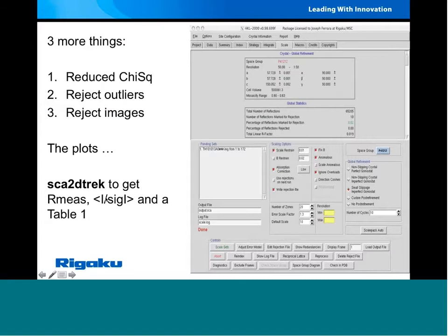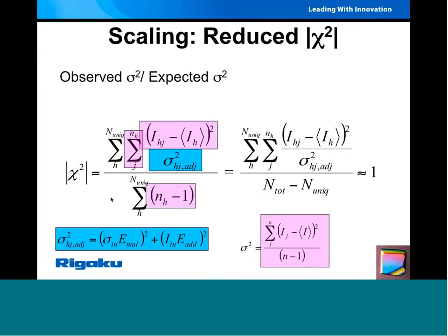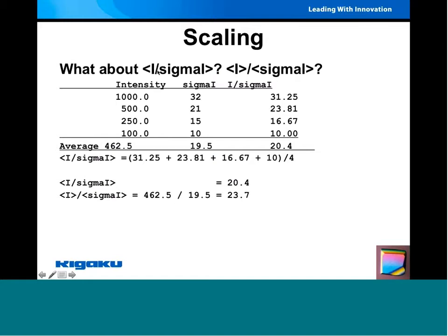PowerPoint presentation. One of the things that I wanted to also point out, this is how we get R measured. So if reviewers are asking, how do you have R measured, and you're using HKL3000, I would use this program. If you're looking to figure out what the I over sigma I is, I want to point out that there's a difference between I over sigma I, average.